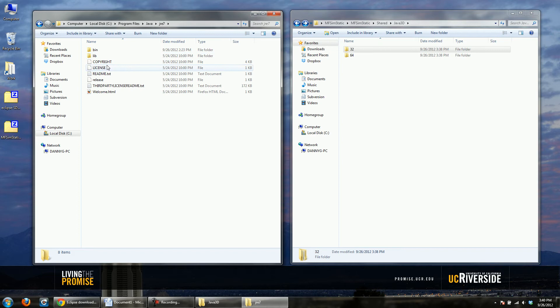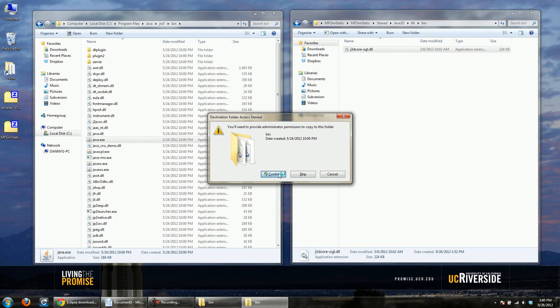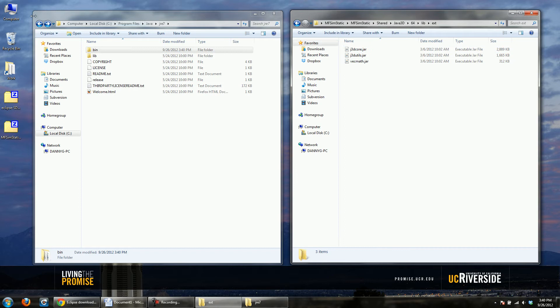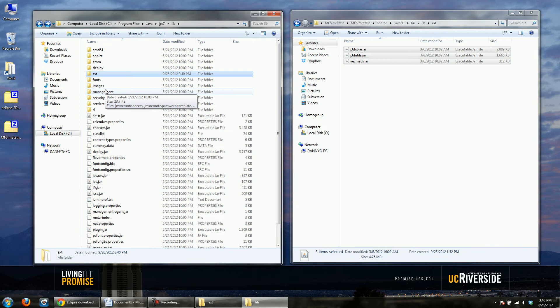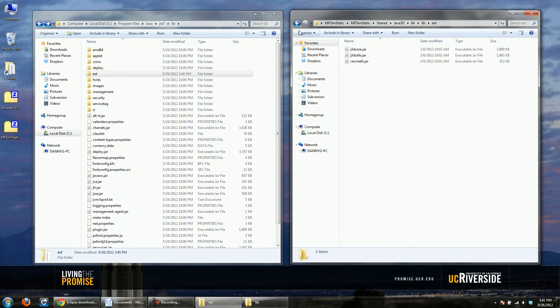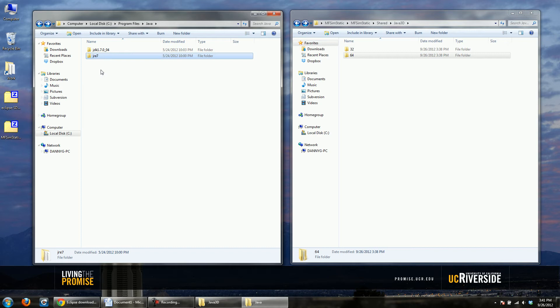Go into Program Files and look for Java — usually it's Program Files\Java — and then find the JRE. For the 64-bit version of Java 3D, you'll see it has a bin and lib. Take all the 3D files and put them into the JRE: copy the bin file and paste it into the bin folder, then go into lib\ext and copy those three files there as well. Whether you think you have the 64-bit or 32-bit version, I found that usually both are installed, so it's a good idea to add the files for both versions — and for every JRE version you have.